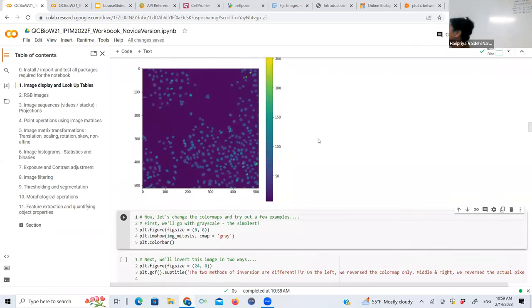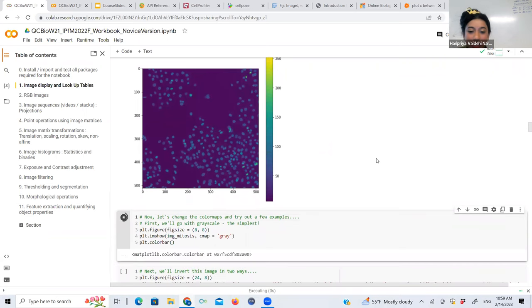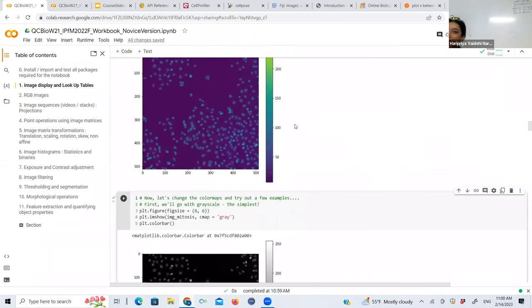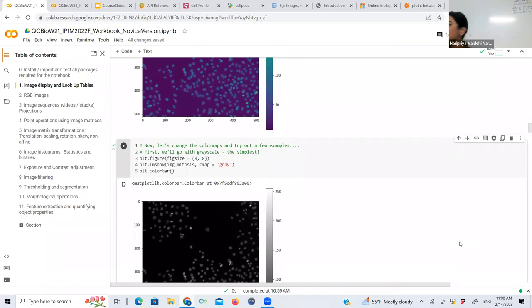Great. So this is just a default color map, right? I put in another example here where you can display exactly the same thing, but in black and white. Note that the image has always been black and white, because black and white is just a sequence of numbers. It's like a unidimensional color representation. I can display it with this black and white color bar, or with this fancy color bar. It's the same values. Nothing has changed except what colors you map it to.